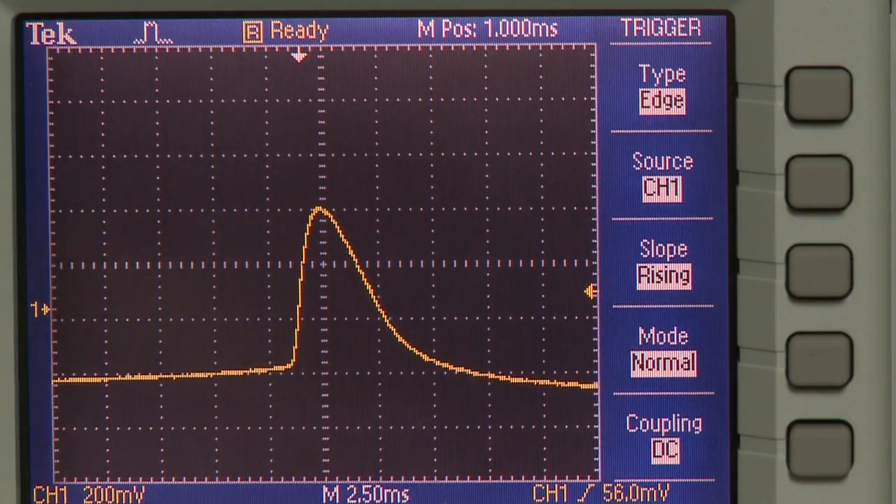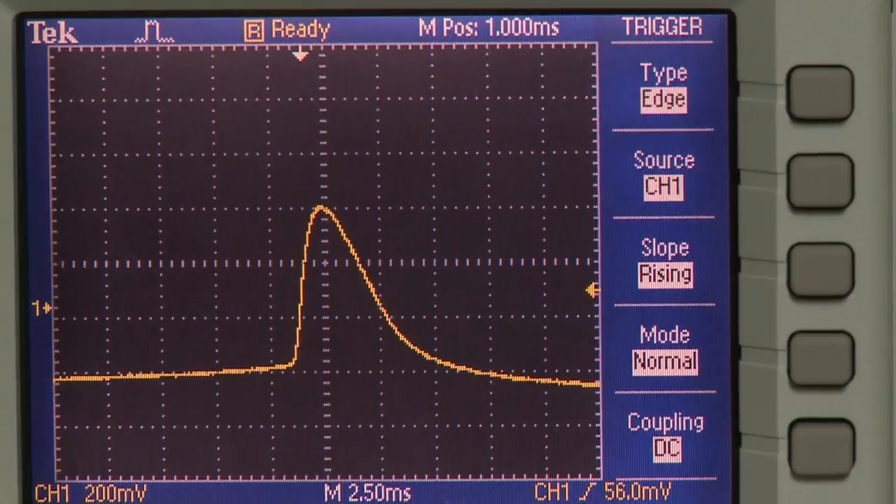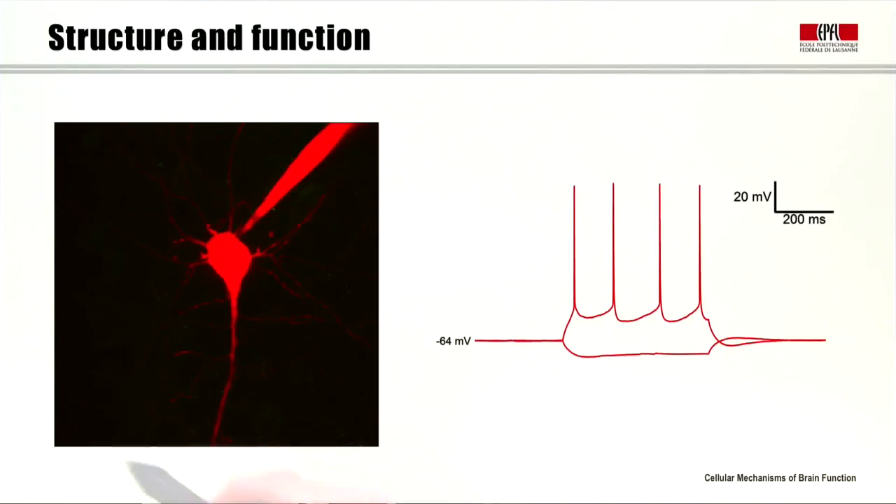We can zoom in and look at the action potential waveform. We can see that the action potential half-width in this cell is around 2 milliseconds. Here on the left we see the two-photon microscopy image of the cell we were recording from. On the right, we see the membrane potential traces of the same cell responding to the injected currents. In the bottom trace, we see that the cell hyperpolarizes, and in the top trace, the cell depolarizes and fires action potentials.